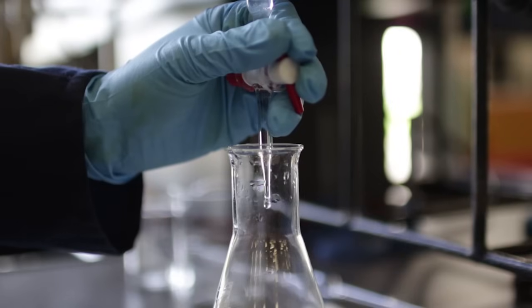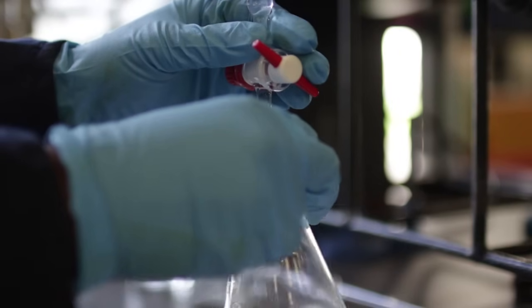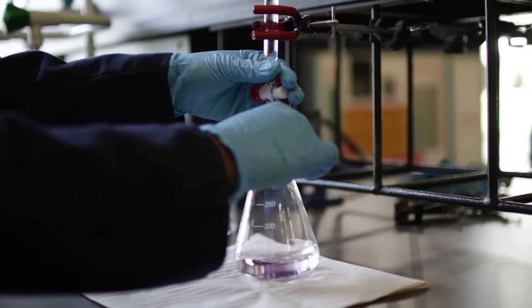It is even possible to add a drop, swirl, add another drop and so on until an endpoint is reached.